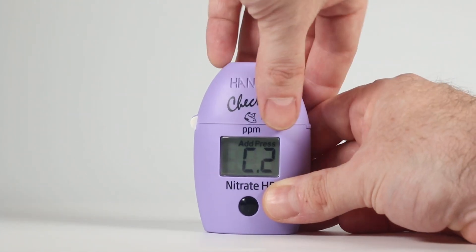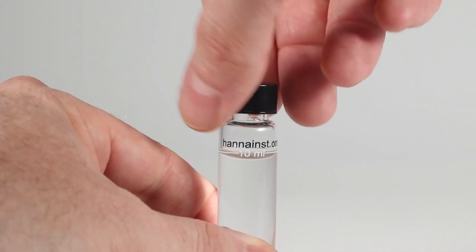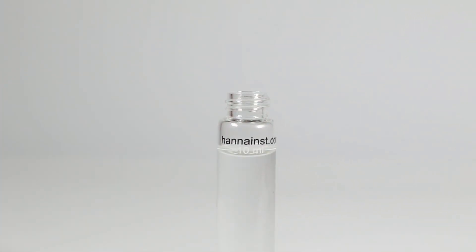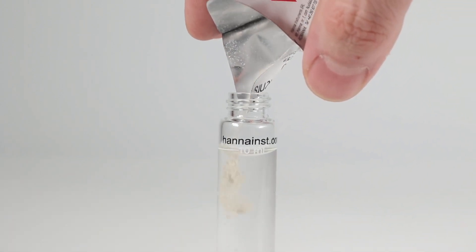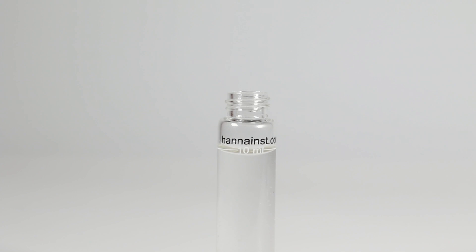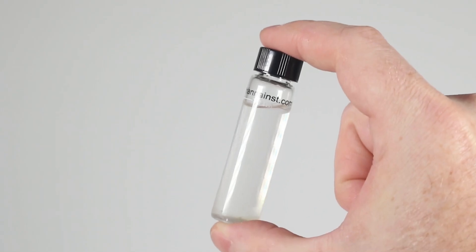Remove the cuvette. Unscrew the cap and add the contents of one packet of HI782-0 marine nitrate high-range reagent. Replace the cap and shake vigorously for two minutes.